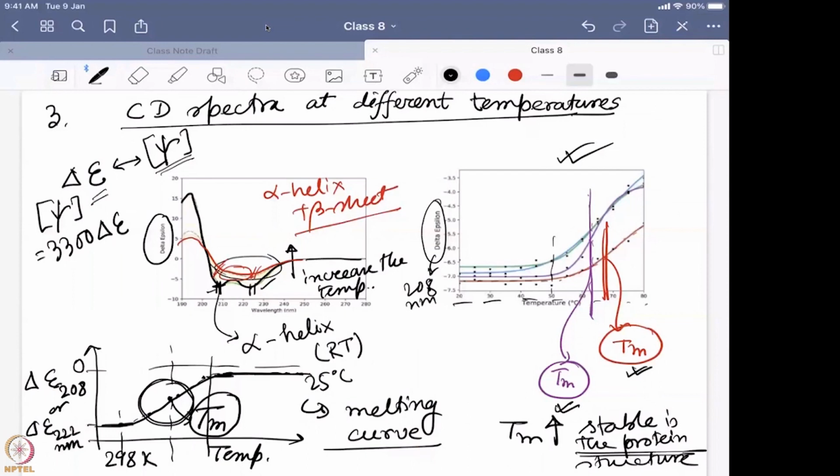And over there, your protein structure will change. Just take a look at an egg. If you take an egg before boiling and after boiling, you can see a liquid structure then becomes solid. What is happening there? It is protein denaturation. It is a melting temperature we are crossing for the albumin, which is present in the white liquidy part. It is actually getting solidified. It is changing its structure. It is melting. It is losing the overall structure. Now, that is going to happen to us also if we actually put ourselves in boiling water.